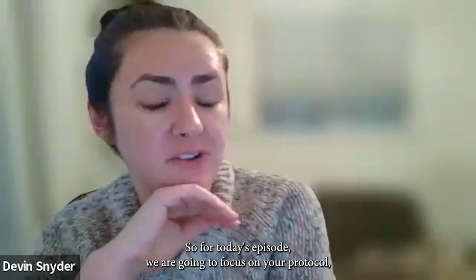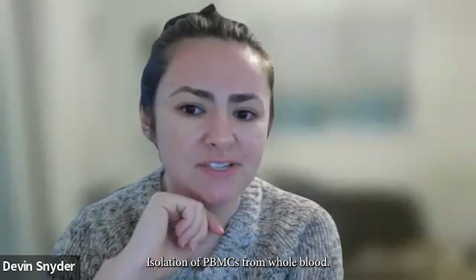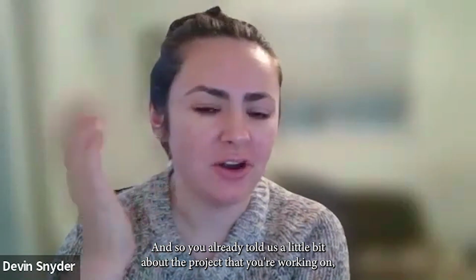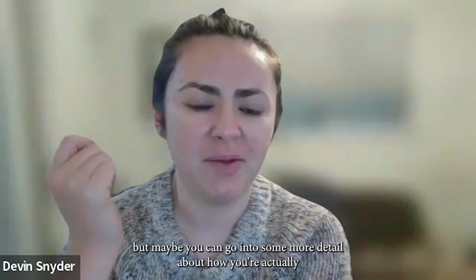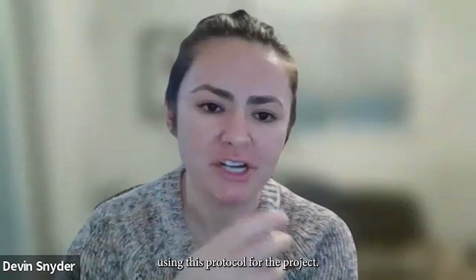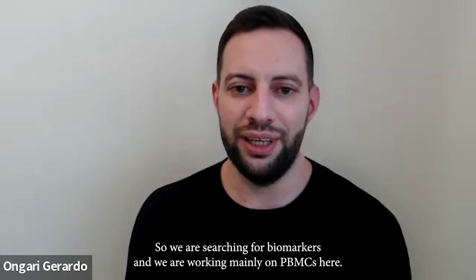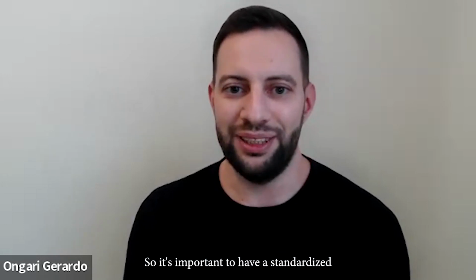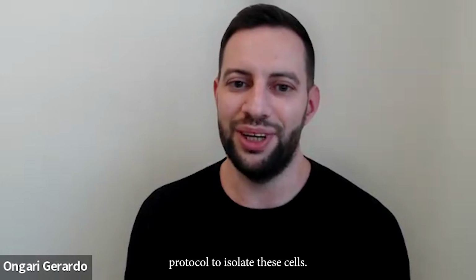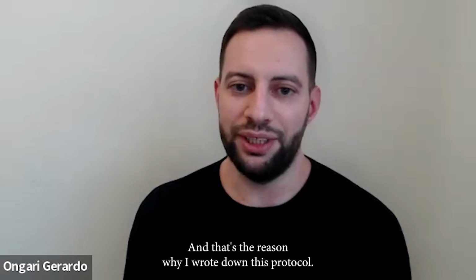Awesome, thank you. So for today's episode, we are going to focus on your protocol, isolation of PBMCs from whole blood. You already told us a little bit about the project that you're working on, but maybe you can go into some more detail about how you're actually using this protocol for the project. Yes, so we are searching for biomarkers, and we are working mainly on PBMCs, or peripheral blood mononuclear cells, and plasma samples. So it's important to have a standardized protocol to isolate these cells. And that's the reason why I've written this protocol.